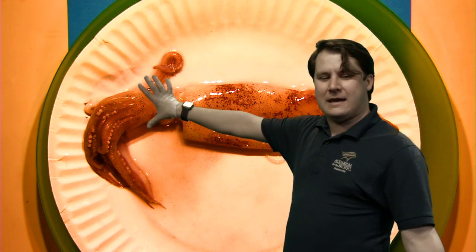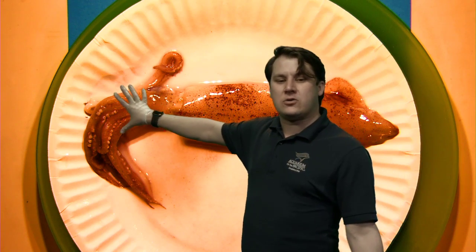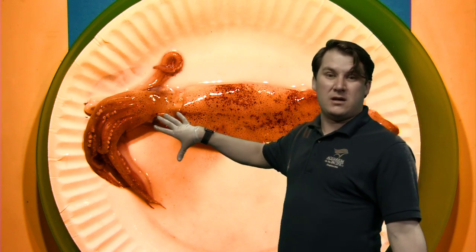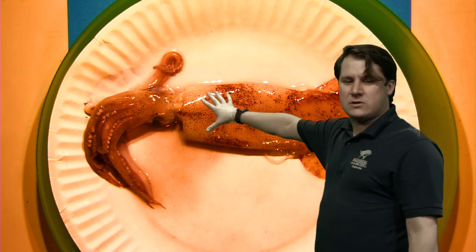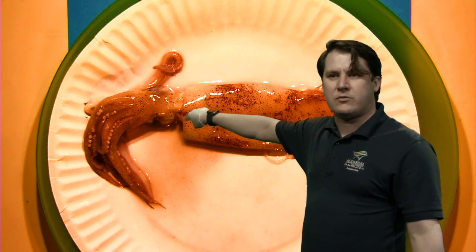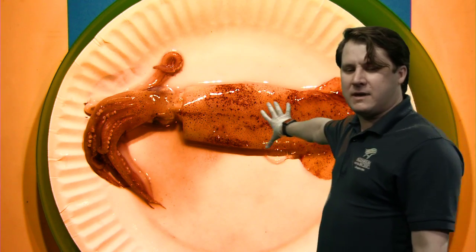Beyond the head, there's another very large part of this animal's body called the mantle. This part is more like a torso. If you think about your torso and the things inside it — your lungs, heart, stomach, all the digestive organs — that's similar to the selection of functions served inside this part of the animal's body. This is primarily the part that we're going to be opening up during the dissection.